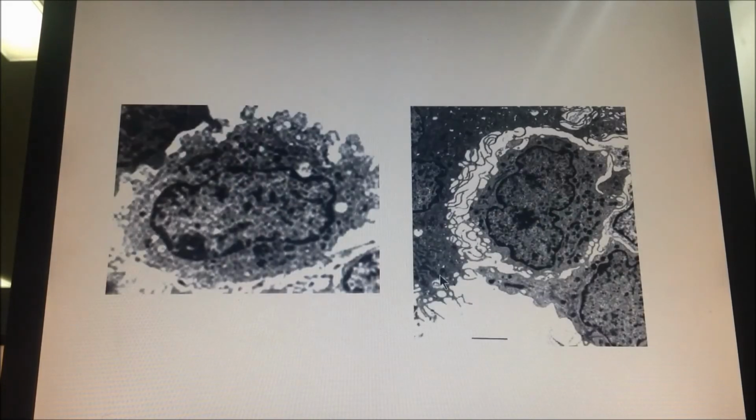Another cell in the connective tissue, it is the second most common cell, هي الmacrophage. Let's start with the section on the right. The macrophage is a cell that can be easily identified. At first, شايفين الشكل is not spindle. The nucleus is highly irregular, indented. Large nucleus and highly indented.